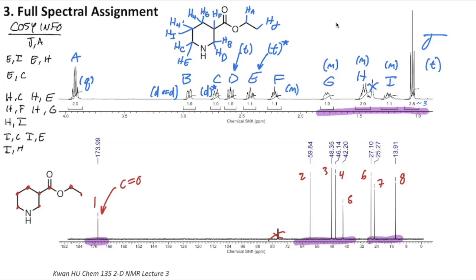All right, so I skipped over tabulating all of that information and bringing it up because I'm confident y'all can do that on your own. So I tabulated what I think are all of the remaining cross peaks that we haven't talked about yet. I might have missed some, but you can always go back and check your work multiple times to make sure that everything adds up and makes sense. And doing things like putting little check marks next to your peaks once you are confident that they make sense helps you make sure you caught everything. So let's just run through the rest of these.